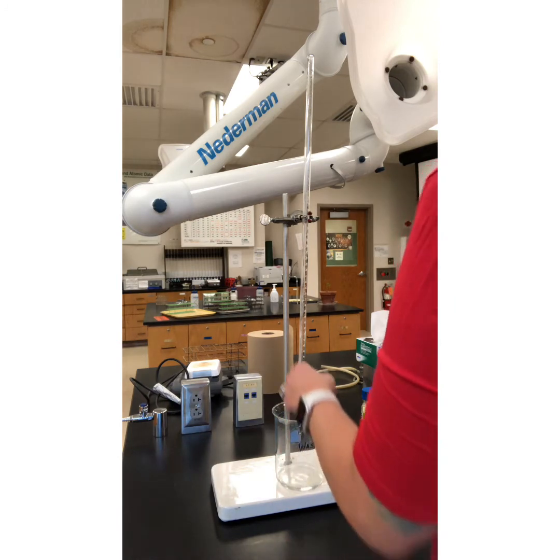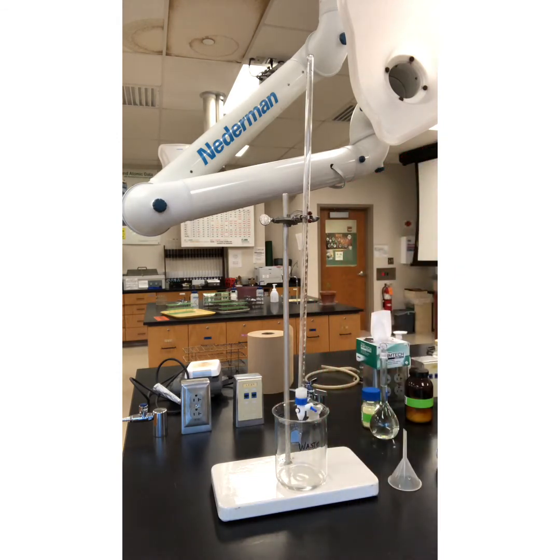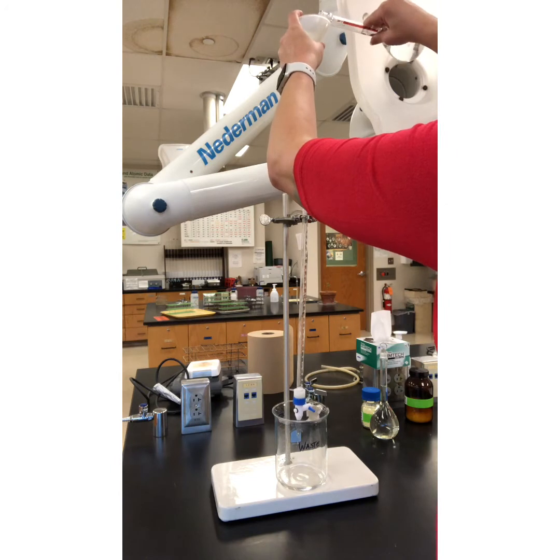Okay, so now that I've done my rinses, I'm going to go ahead and fill my burette with my zinc sulfate solution and note my starting point and record that in the data for you. All right, so now I'm going to fill my burette. Doesn't matter exactly to where, as long as I note exactly where. I'll spread my funnel. As long as I know exactly where I have filled it to.